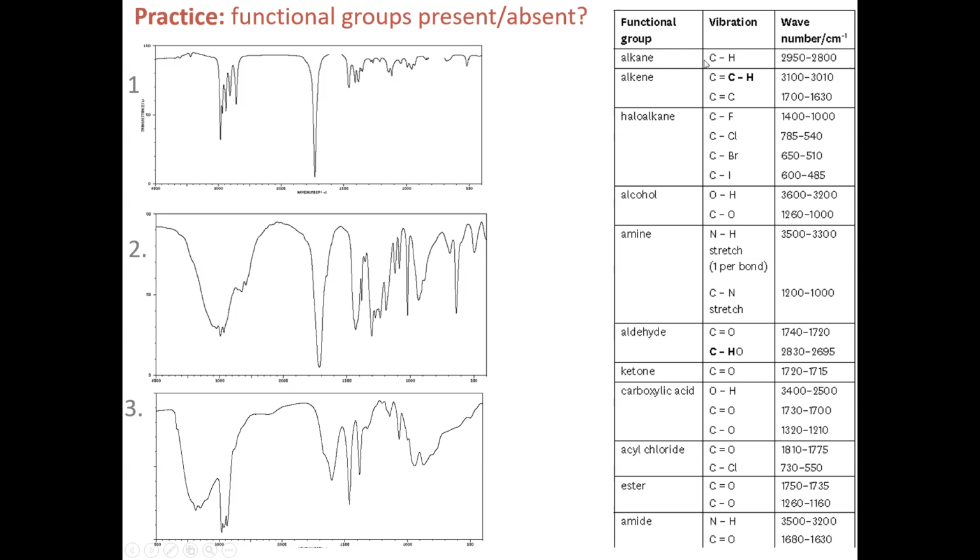So you can see where you would find, for instance, the carbon-hydrogen stretch, if it's attached to a carbon double bond. Just in case you forget, you don't have to learn those stretches off by heart. They are given over here. But remember, you do need to read exactly where each peak is using the values on the x-axis. These are a little bit small, I know, but in the task you would have to do it.